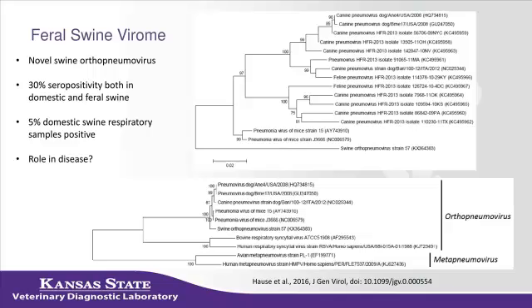So the question was, what viruses are in wild pigs? Not a lot of studies. So we sequenced 100 nasal swab pools from wild pigs to see what we could find. To be honest, we found hardly anything. These were the cleanest pigs I've ever seen. Most of the pigs didn't have a virus in them.